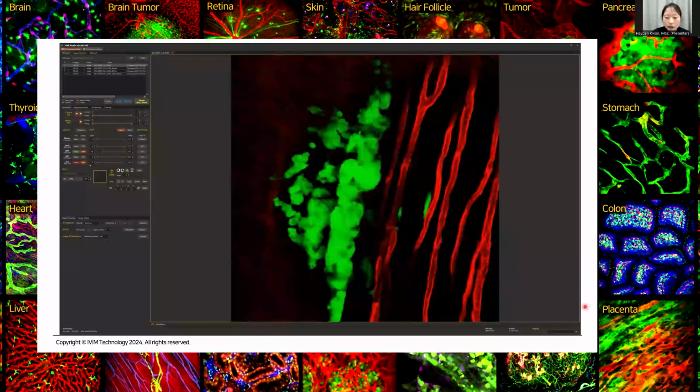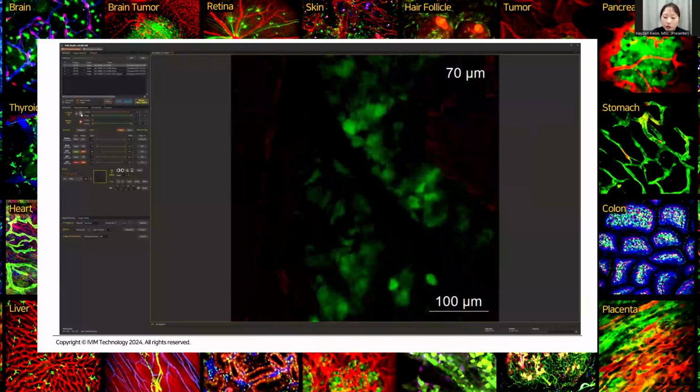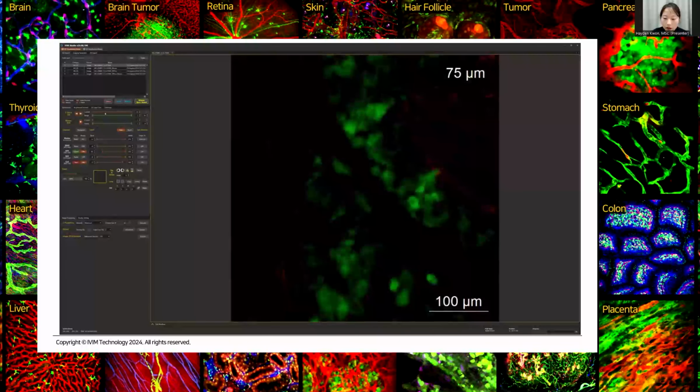Once the necessary adjustments have been made, we can play the Z-Stack images with the Z-Stack stamp for better visualization and analysis, and also the scale bar. This allows you to observe the acquired images sequentially, gaining insights into the cancer's tissue structure across the different focal planes.